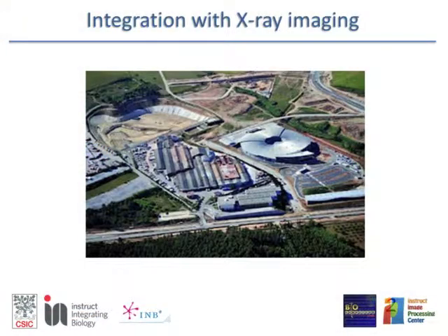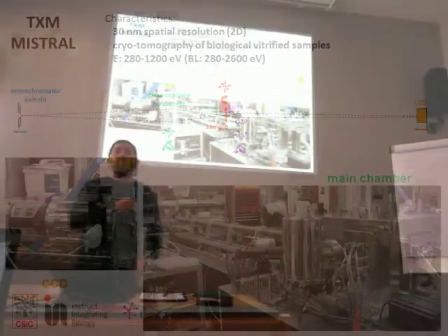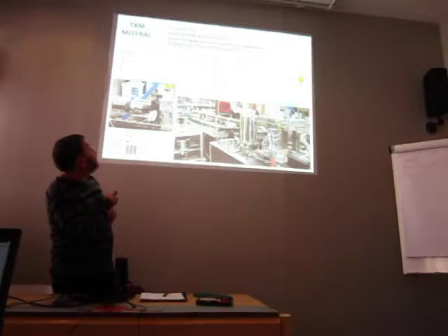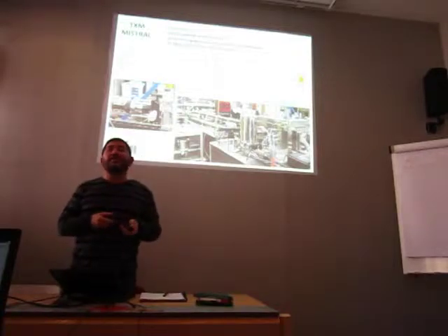which one of them is the electron microscope, and this is really how it is an X-ray microscope. Well, do you know how long this is? It's about 10 meters, okay? So it's a little bit bulkier than the electron microscope. There are only 3 in the world. And the amazing thing of the optic is that everything of the specimen, objective, everything is in 2 centimeters. Okay? So you have 10 meters, but everything happens in 2 centimeters.